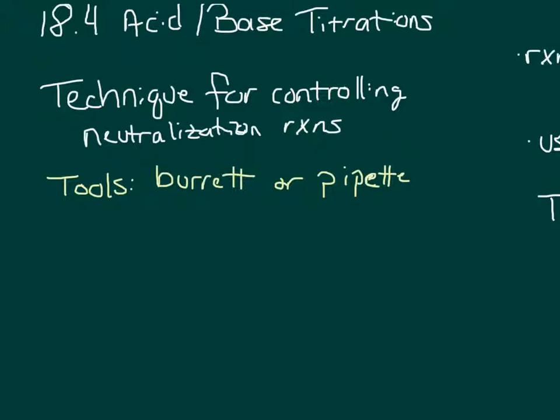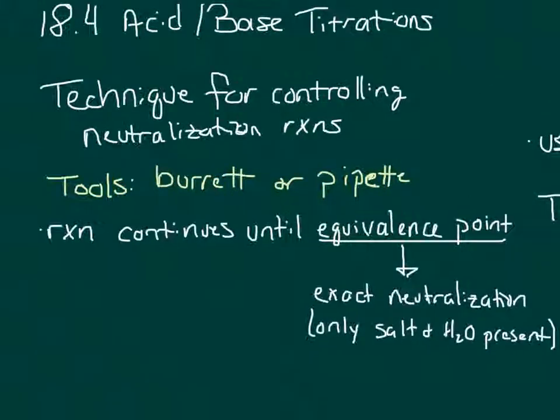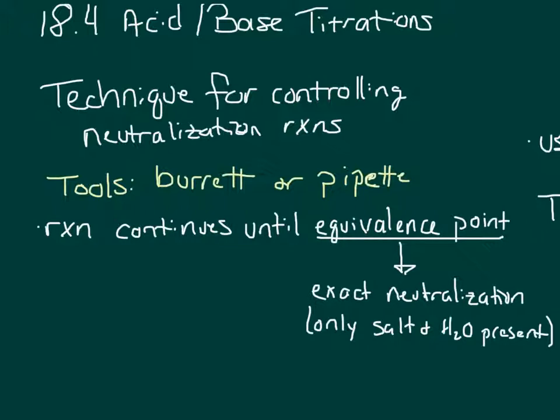Or you could do it with a simple burette or pipette and administer the titration drop by drop. A reaction will continue until what is called the equivalence point. This is the point of exact neutralization, where only salt and water are present.